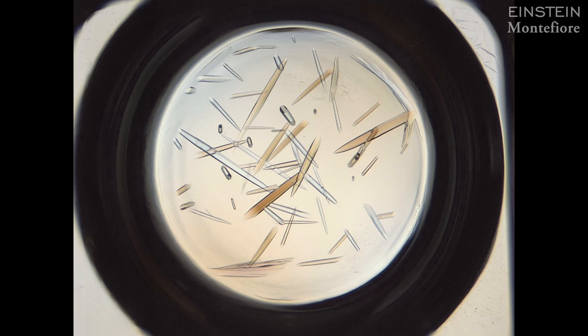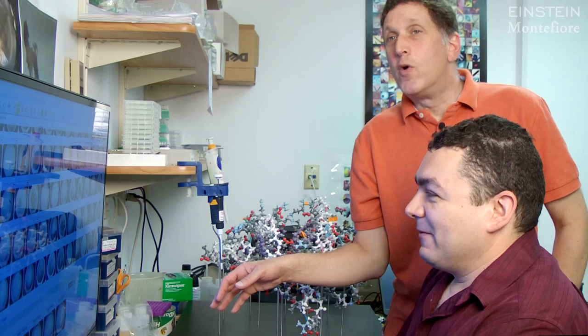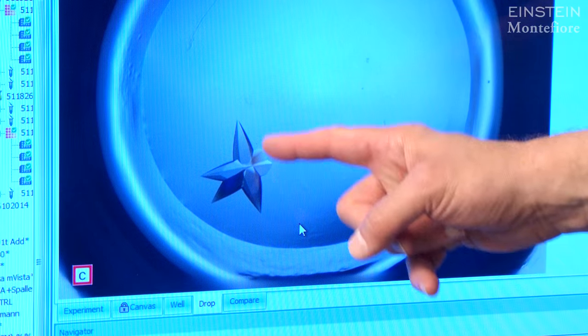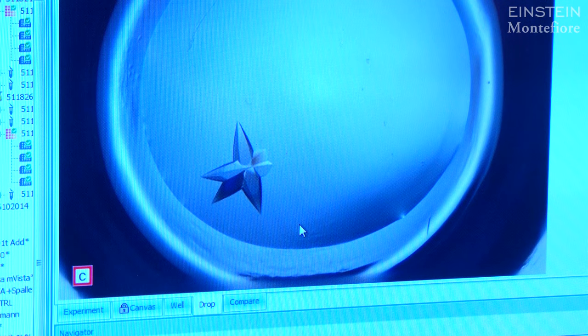So we take purified proteins and turn them into crystals, much like the salt and sugar crystals you might have at your dining room table. Once we've grown the crystals, we're able to image them, as Rafael's demonstrating, in very high detail. And here's one such example, which shows a crystal with very beautiful clear faces and very sharp edges.